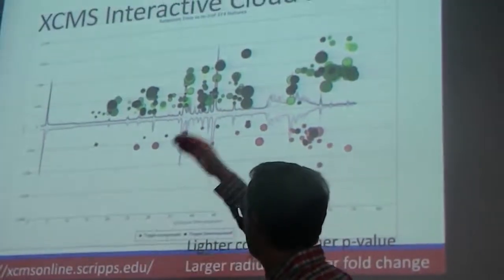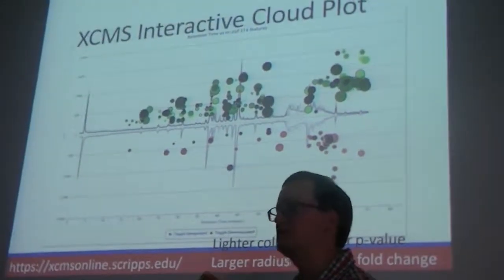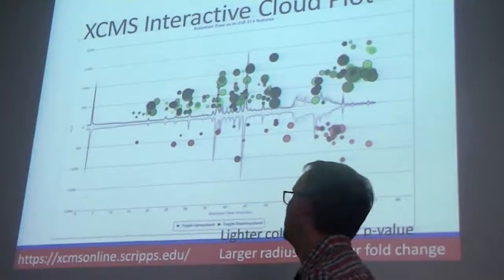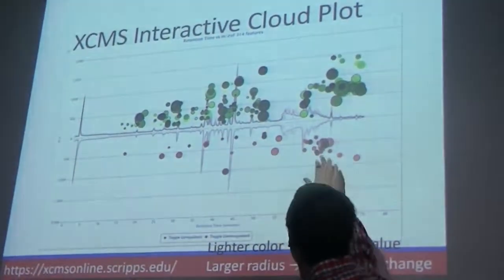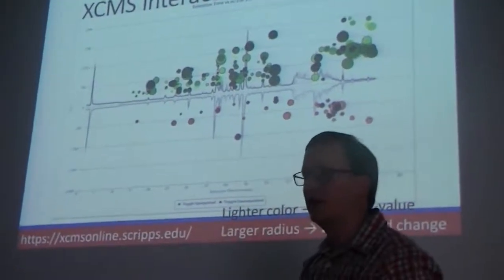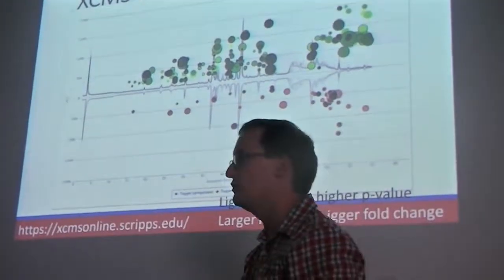In this case, we're able to show one experiment on the top, one experiment on the bottom, and this allows us to make an assessment of whether these experiments crested in the same places. We also have these values, though. So we have upregulated and downregulated. Those are the two colors we're showing, where green and red are the colors corresponding to that.